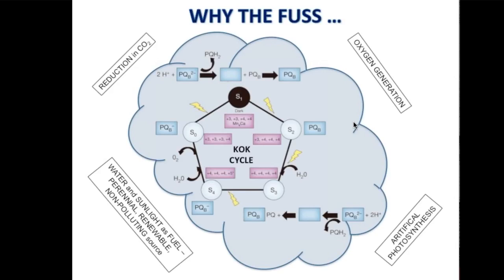So the idea is to try and characterize as much as possible what is different or similar about state 3 in the catalytic cycle as compared to state 1. And here and there, I'll take some reference to some of the experiments that were done a little later on, characterizing, if possible, the S4 state, to just bring in comparison and make better understanding out of it.